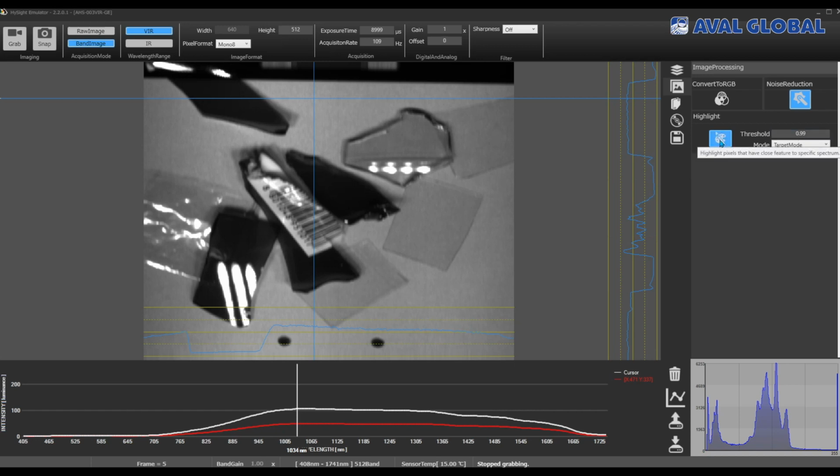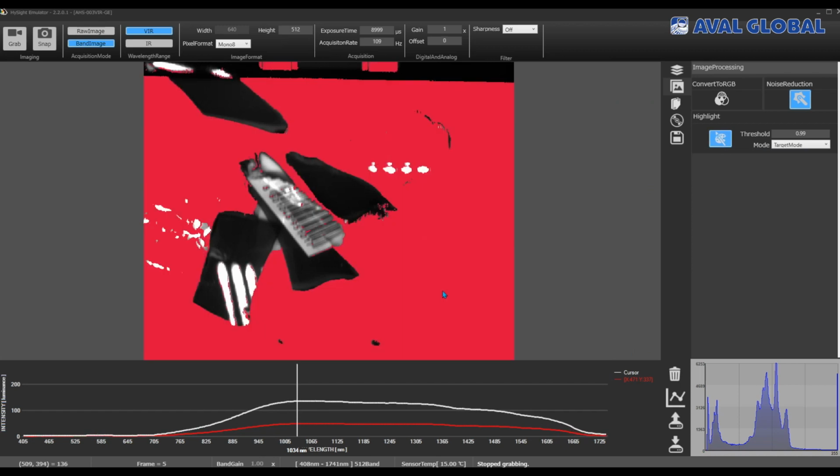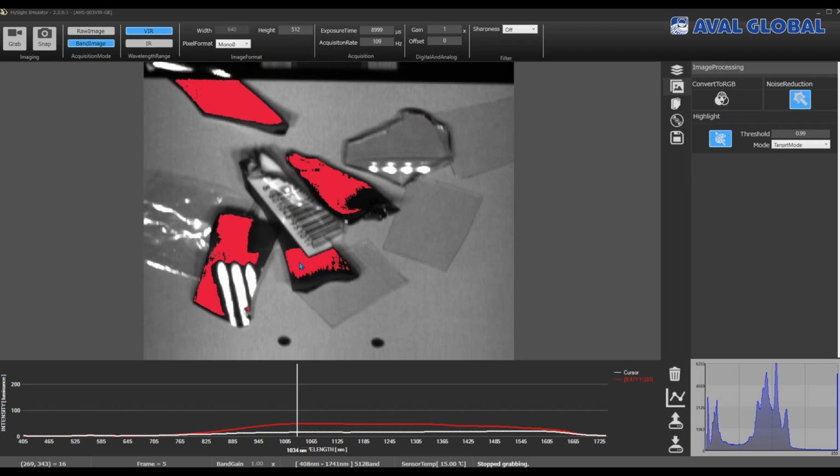Clicking on an icon in HySight detects the spectral data at the coordinates the mouse is pointing in the displayed image and displays similar colors. Threshold sets the detection condition range. The higher this value, the stricter the detection conditions.